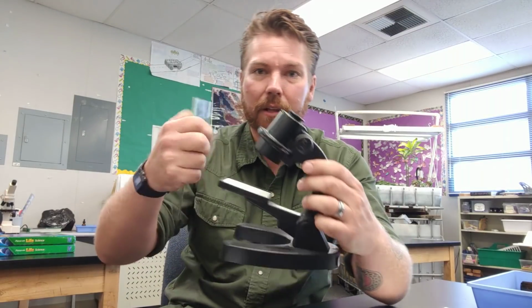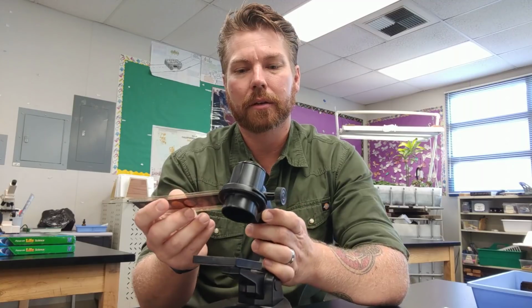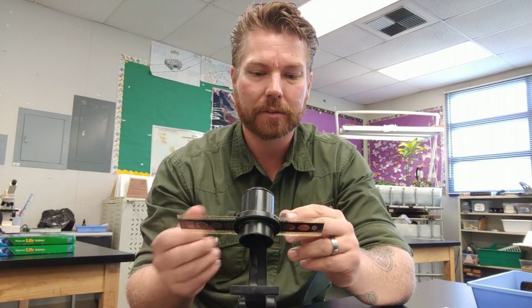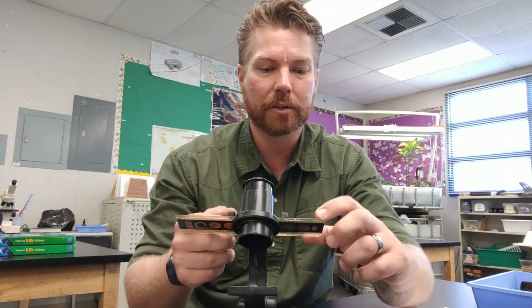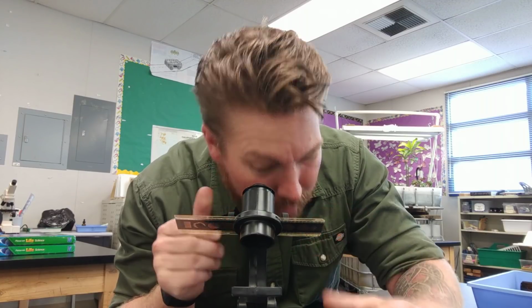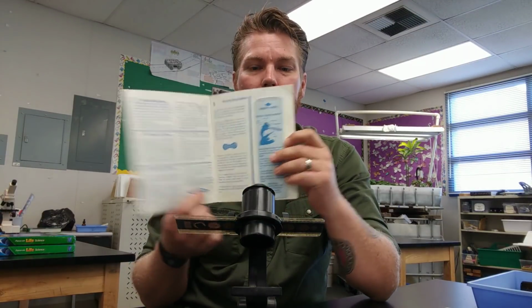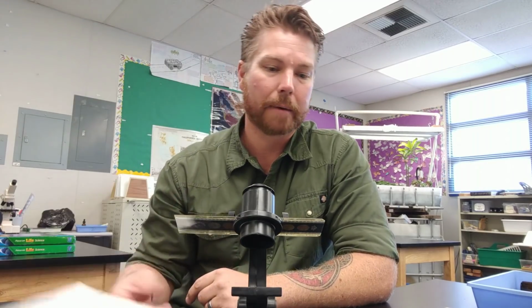There's a slot right on the side of the microviewer, and you put it in like so, and you can move this back and forth to look at the different images. The knobs on the side are for focusing on the image. When you look through, there should be a number for each of those images right at the bottom right. The packet will tell you what the numbers correspond to. This one has 8 different things that you can look at.